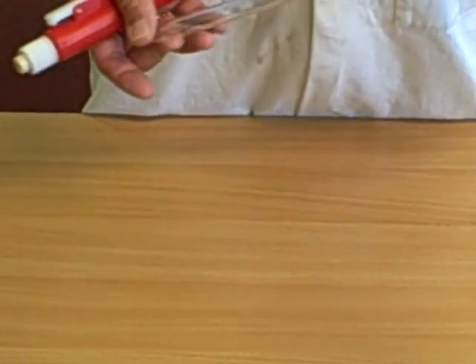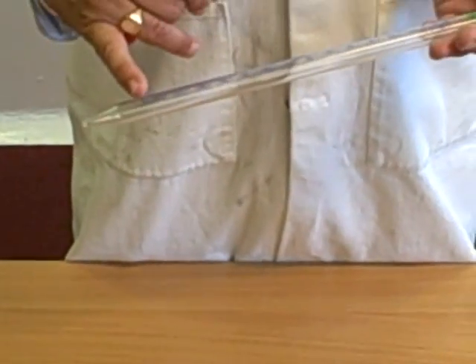A pipette is another accurate way of measuring liquids. This is a 25 mil pipette. It goes from 0 to 25.